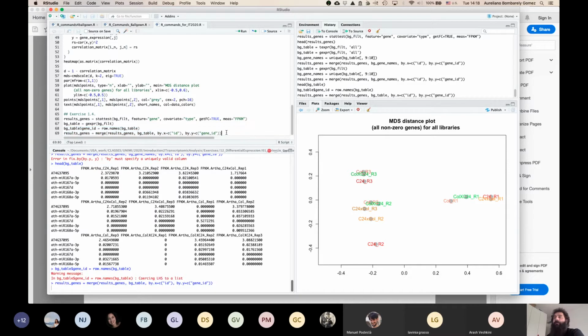Then hopefully, yeah, that will fix the problem. As I said, I think that still will go fine, because in some ways we were just using names. I can hear my computer complaining about this search. As I said, we can keep it just as before.